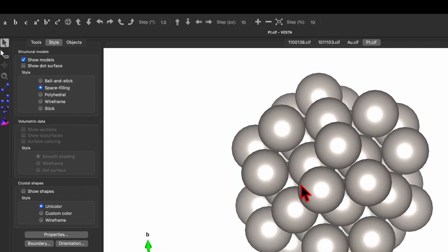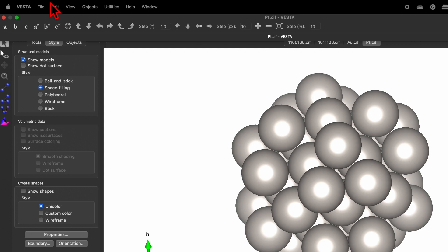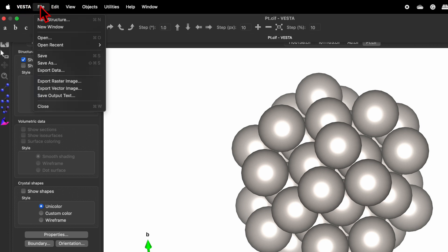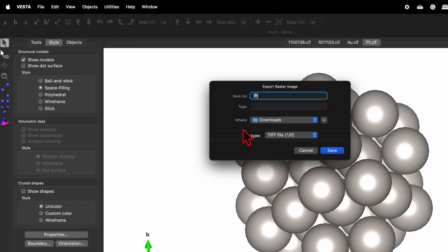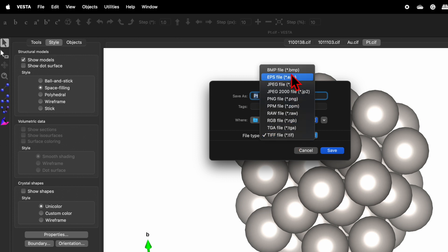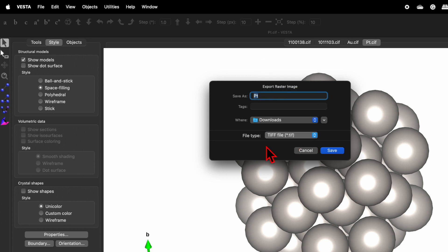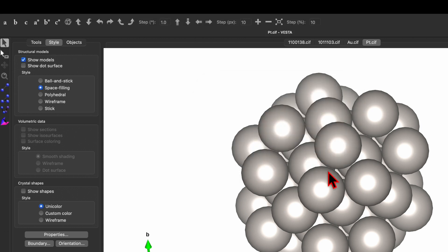If you want to save this file, go to File → Save As, or use Export Data → Export Raster Image. You can give the file a name, choose the file format, and simply click Save — the image will be exported.